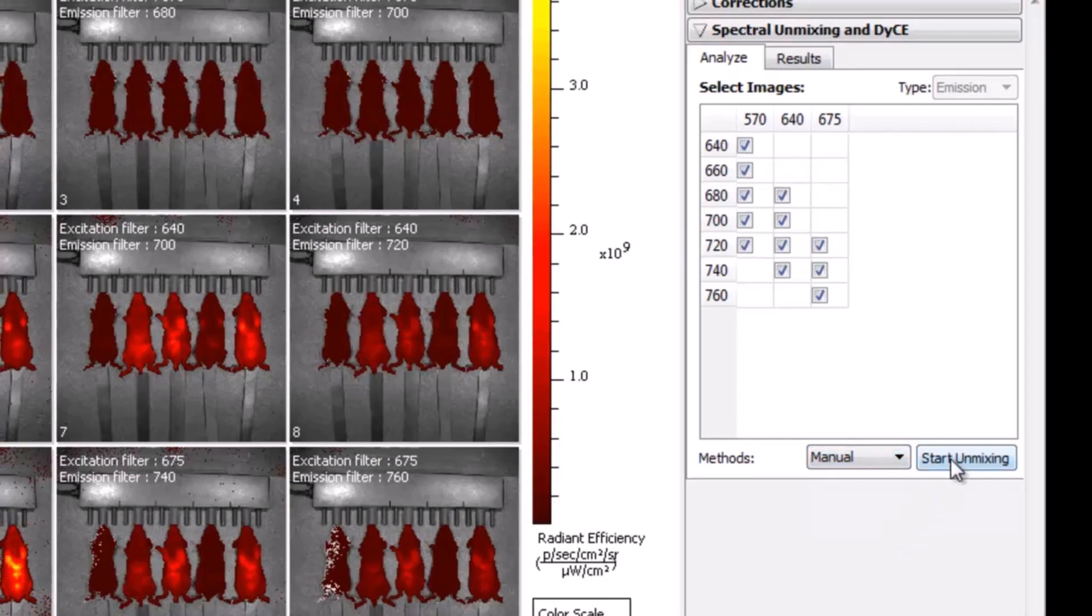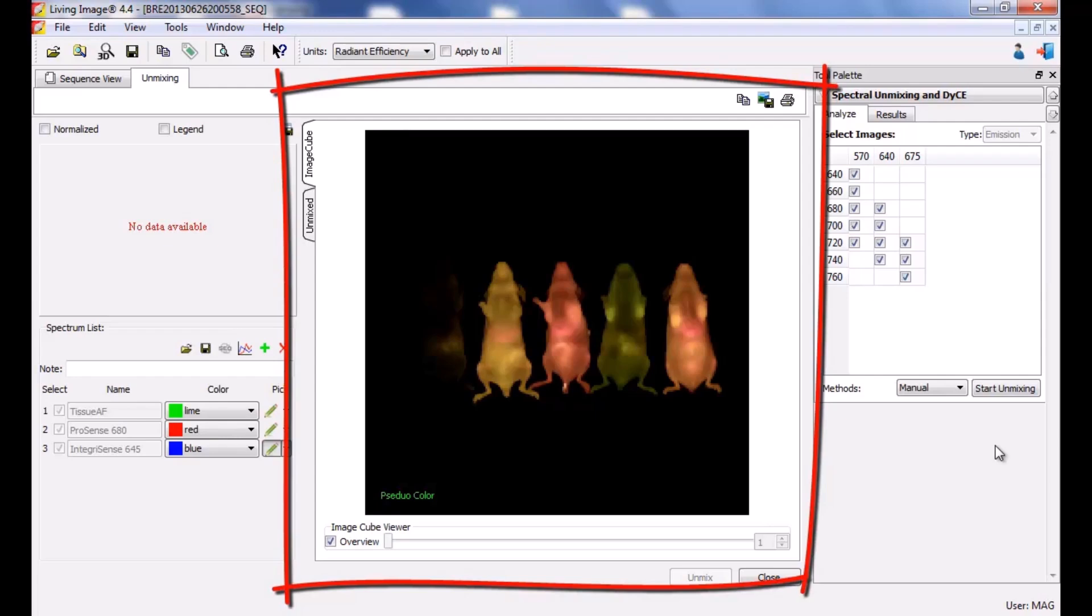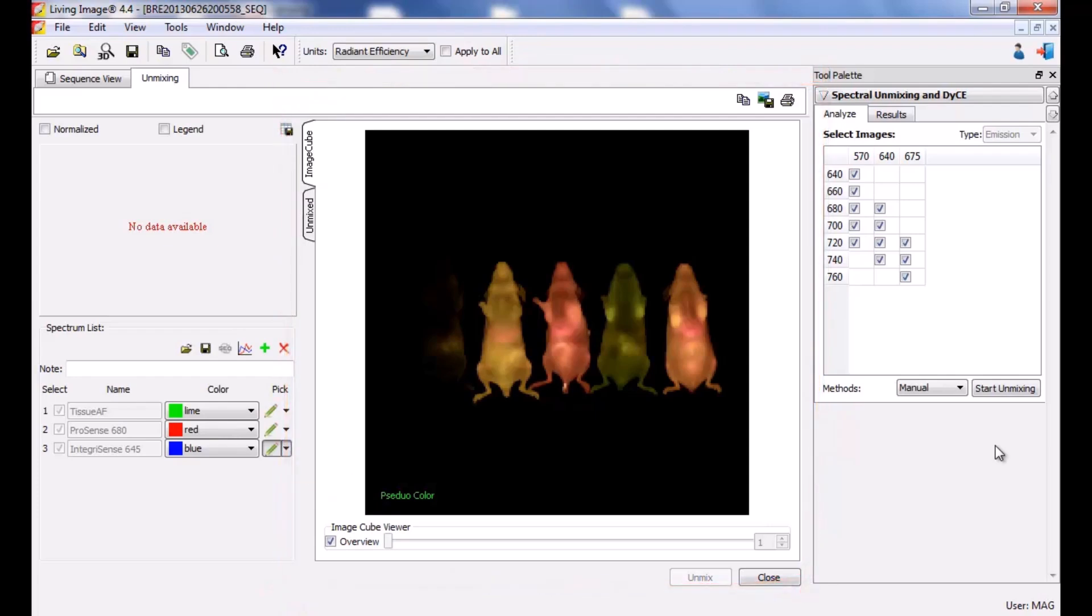Click start unmixing. The image window will display with three sections. First is the large image cube viewer, essentially a z-stack of all images from the sequence superimposed onto each other. To view individual images, uncheck the overview box. The second is the spectral graph on the top left. It shows the average intensity as a line for a pixel or group of pixels throughout the emission scan. The spectrum list on the bottom left contains drawing tools for selection of pixels that will be utilized to generate our probe curves. Our components are pre-labeled based on the imaging wizard setup: tissue autofluorescence, the 680 probe, and the 645 probe.